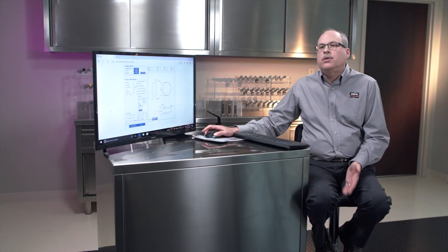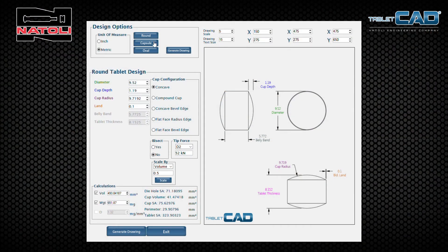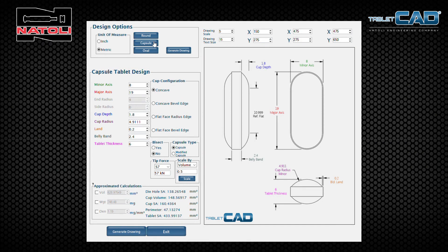Let's go to the oblong tablet designs that Tablet CAD offers. We'll start with capsule — click on the tablet shape of capsule and you get a new control panel. You have major axis, minor axis, cup depth, land, and thickness of your tablet, same as the round.